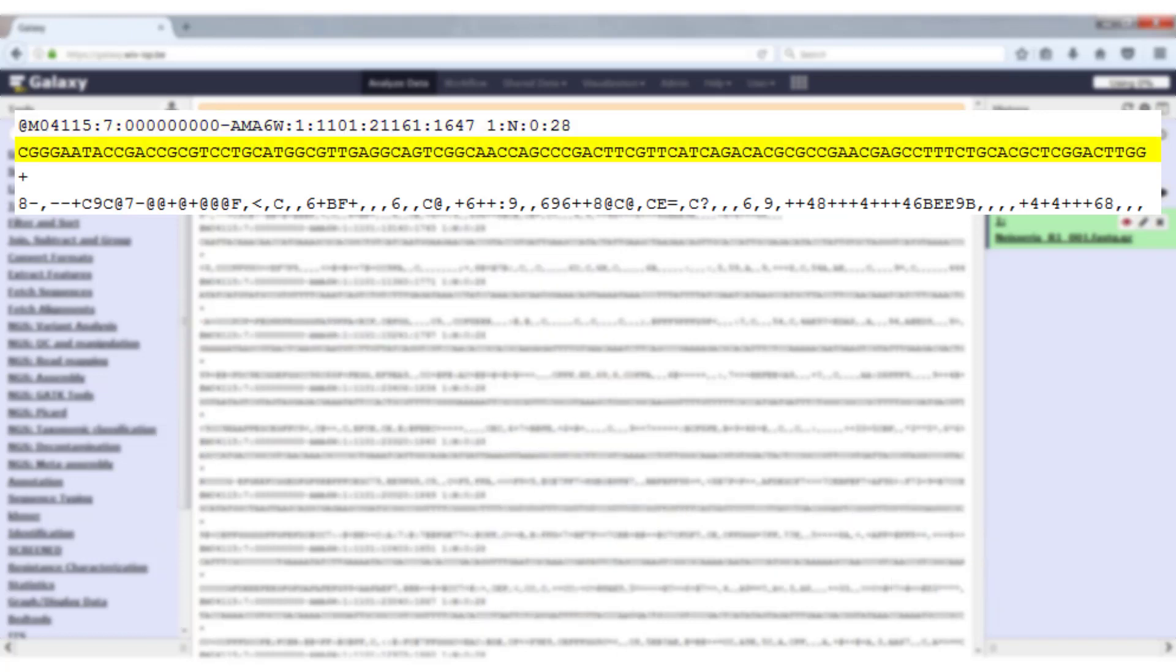In the second line we find the raw sequence. This is a sequence that was called by the sequencer regardless of the quality of the read.